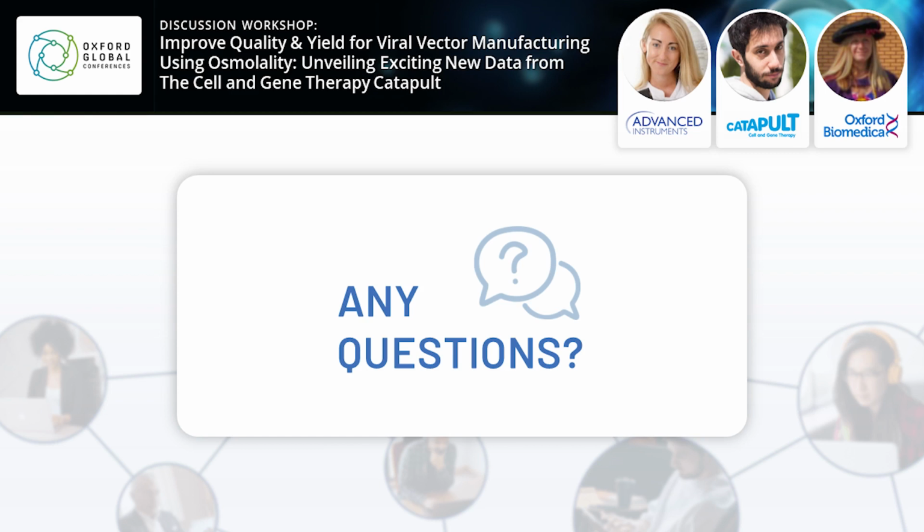If I start this off from Advanced Instruments' point of view, we know that data integrity is becoming a real discussion point now with customers and laboratories. And regulations, like I said in the presentation, are ever changing.